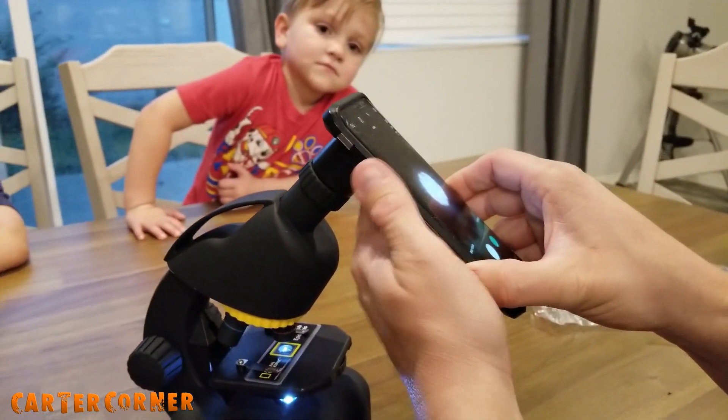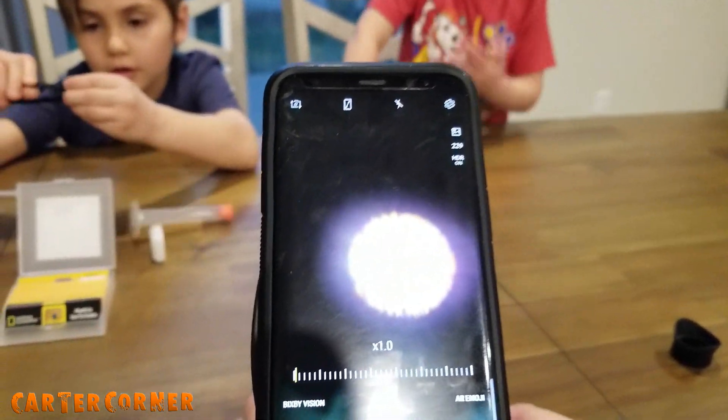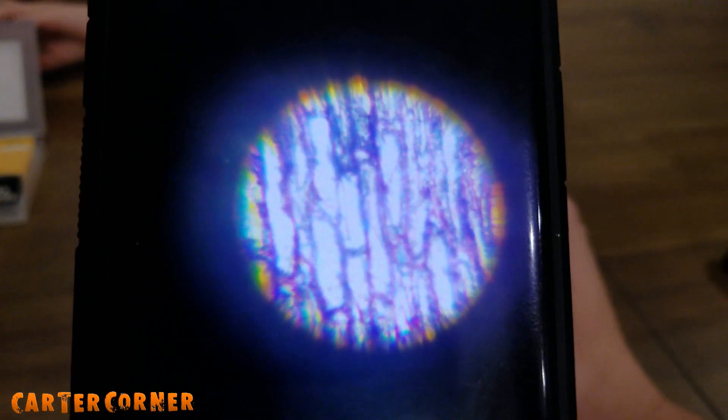Now Daddy's getting ready to put the cell phone on there so we can record what you can see. These long rectangular objects are the onion cells. The dark lines between them are the cell walls.